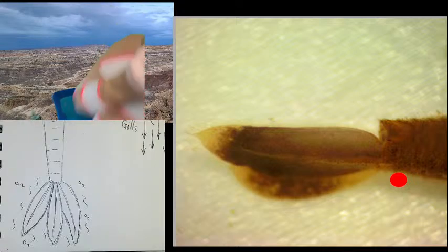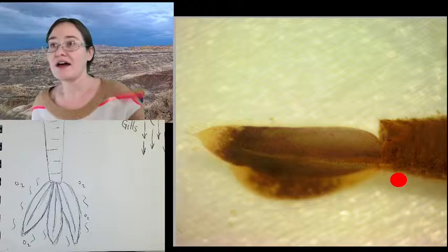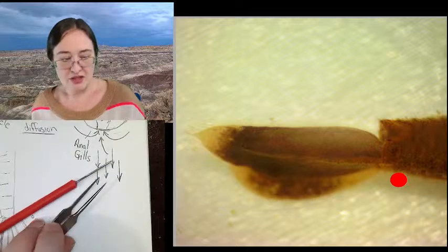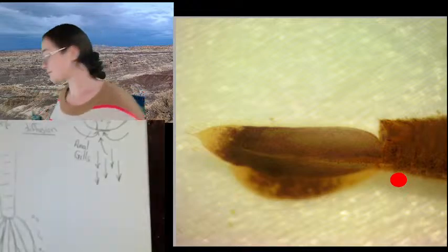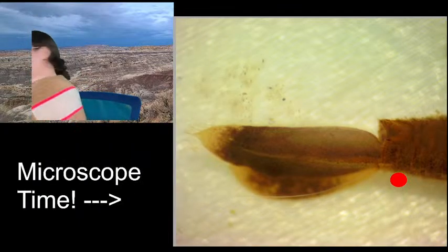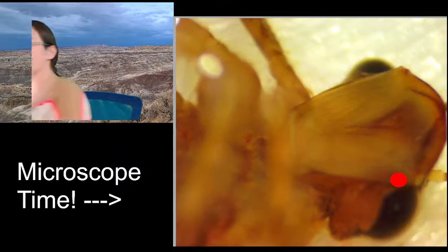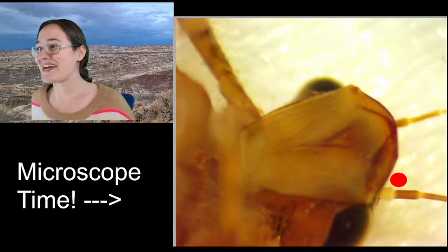All right, so this is my little leather pouch for all my bug tools. And I've got a dissecting probe that's just a long guy with a little point on the end. And I think I'm going to grab these jeweler's forceps. They're nice and sharp. Don't mind my head as it disappears into my microscope. All right. Oh, man. This is fun.